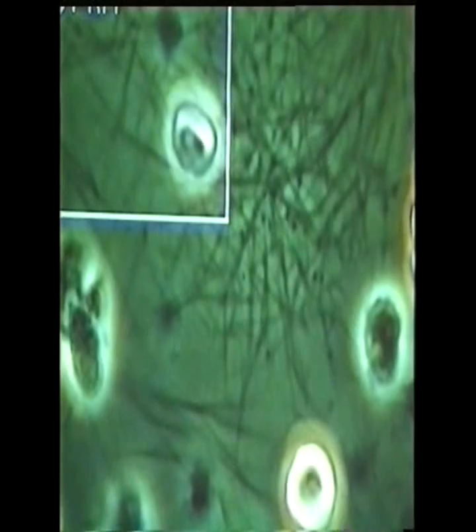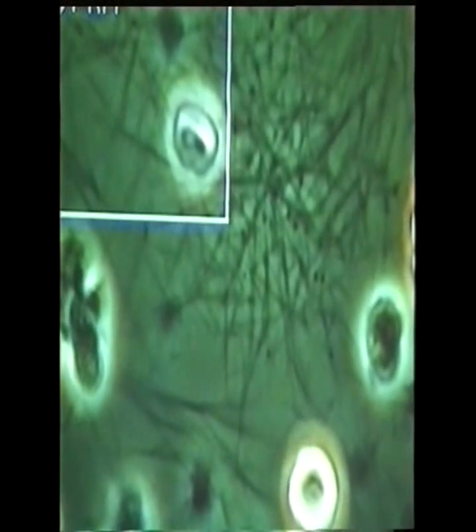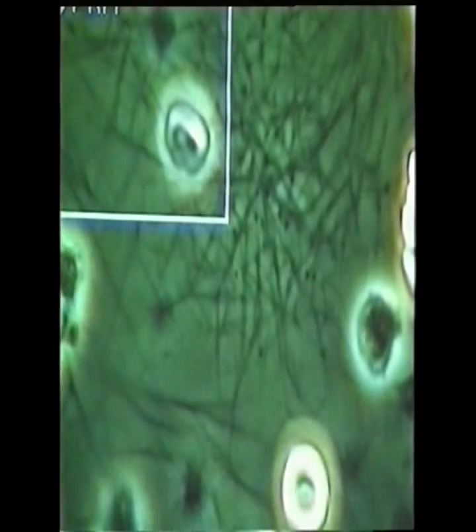At this stage, it is interesting to observe the activity of the leukocyte. Using the phase contrast method, we can see it better. At the bottom of the picture on the left hand, you can see the leukocyte. It is very active and is slowly crawling out of the display. This indicates that they are engaged in cleaning up extensively. This enlarged activity of the leukocyte could explain the flare-up in some people.